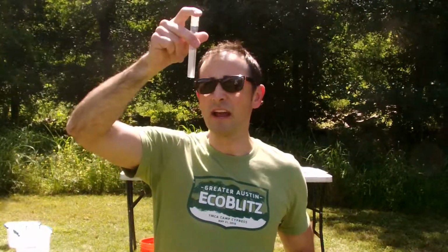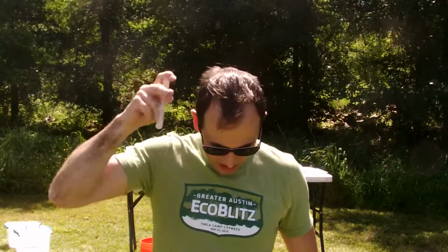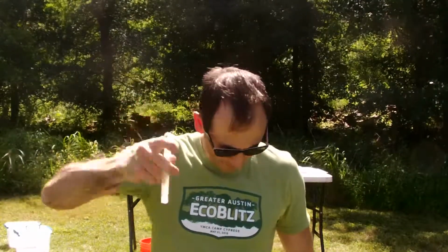You want to make sure when you're popping your tab in, you get everything in, all right? Mine's kind of breaking apart a little bit as I do it. Tab 1, you actually don't need to wait once you have it fully dissolved. Then you can add 2, and then you're going to wait 5 minutes. So once again, make sure you're using your stopwatch or your phone or whatever you got for your timer. We're getting there. Not quite disintegrated just yet. All right, we're going to shake it up. No songs this time, I swear.